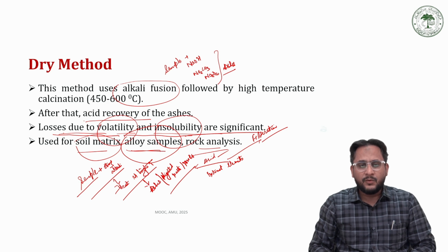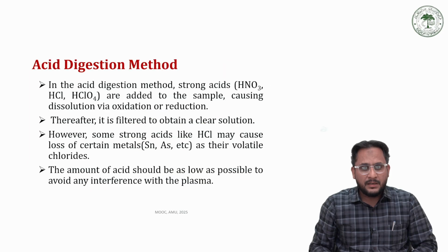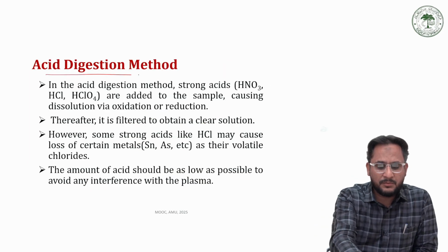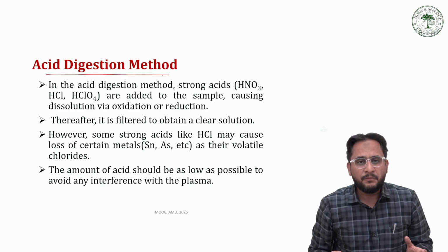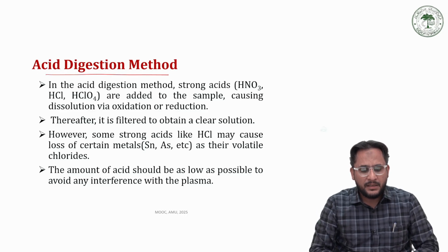Unless and until we are maintaining good solubility, the technique is very good. Then the other method is the acid digestion method. So the previous method was the dry method where we are using alkali fusion. Now this method is called the acid digestion method.